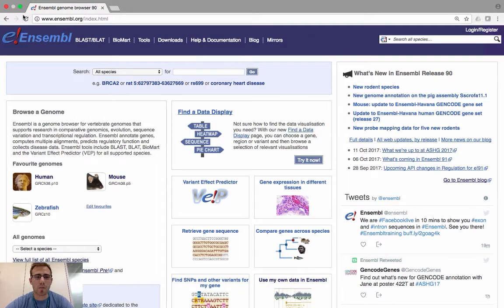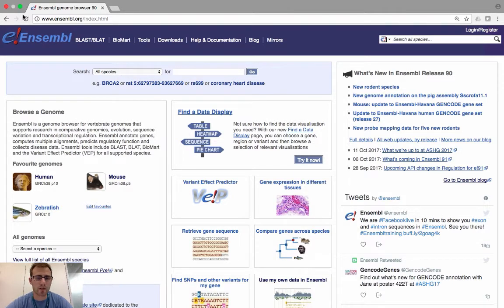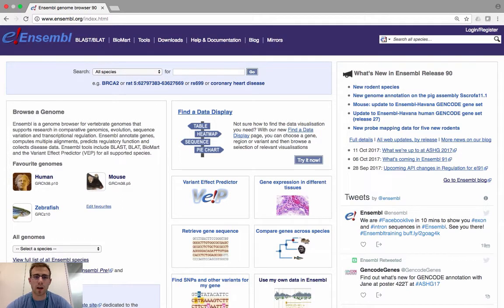What we want to do is show you how to access, view and download the exon and intron sequences with Ensembl. In our example, we're going to use the ESPN gene as our gene of interest, and we're going to look at a particular transcript of that gene and try to find and download the exon and intron sequences.